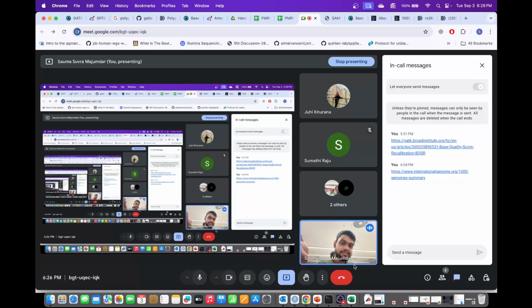But for best practices, in GATK there is a best practices page that tells you the best practices for WGS pipeline usage. There they also say it's better to do BQSR than not to do it. But in the case of exome sequencing, for example, I do not use BQSR with the variant caller, because I'm not much bothered about it, since BQSR mostly helps in the intronic and intergenic regions.